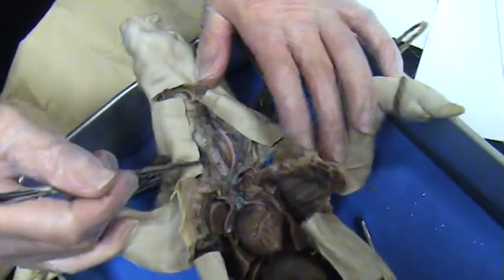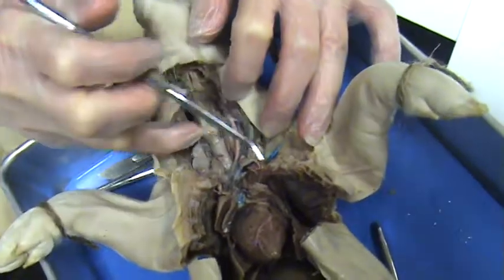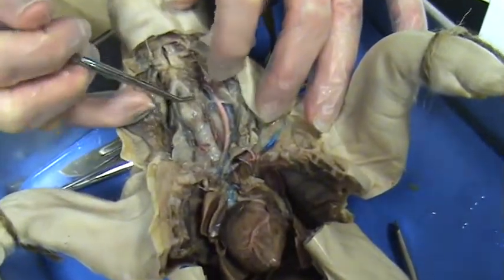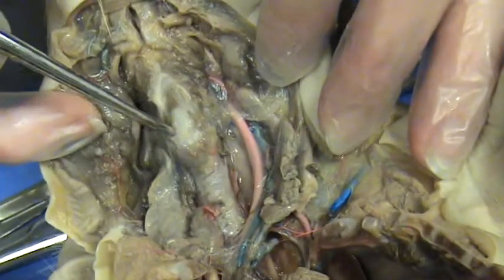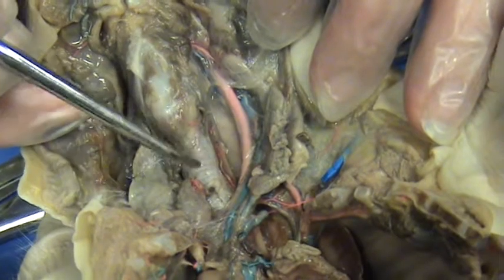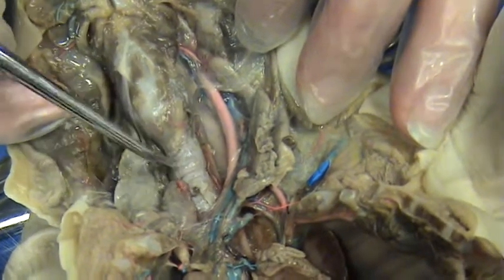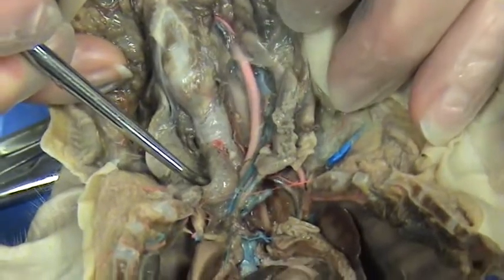All right. So we'll do it region by region the way they do it in med school. Okay. So, well, they don't do system by system then. Like, what's everything in this part of the body? So, larynx. Okay. Trachea. See the rings? Cartilaginous rings that we saw in the sheep trachea? Yes.